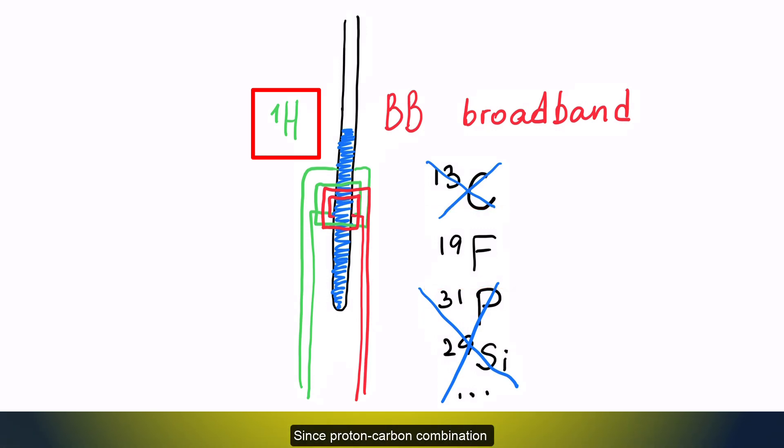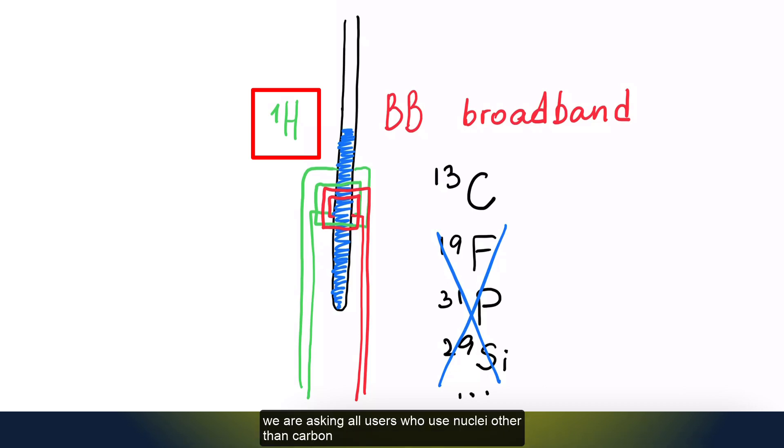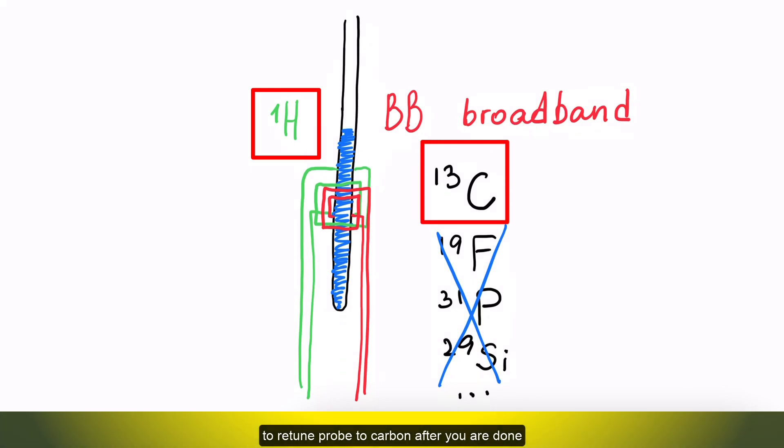Since the Proton-Carbon combination is most often used in our facility, we are asking all users who use nuclei other than carbon to retune probe to carbon after you are done. This makes tuning for next users, often less experienced, much faster, and they will appreciate that you care.